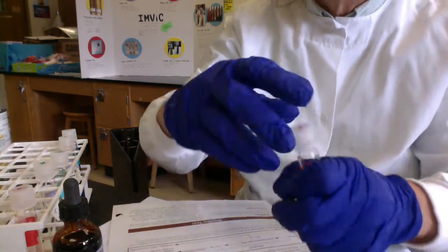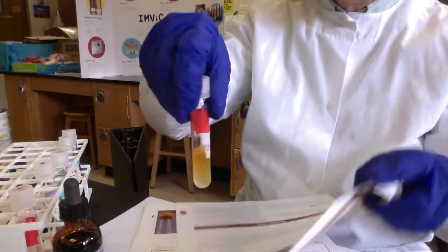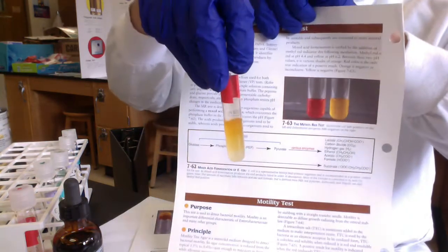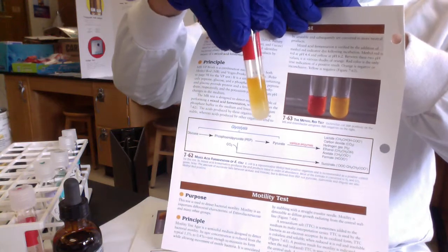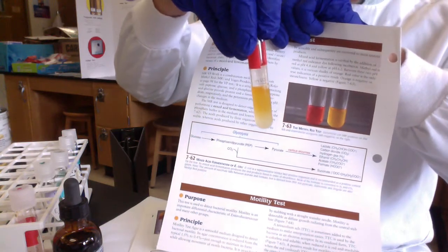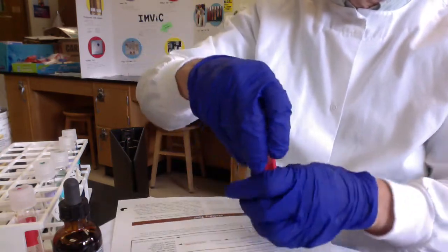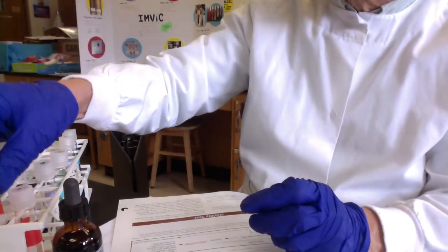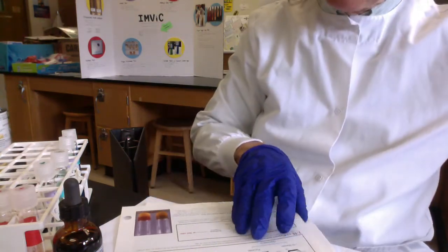Okay, so you guys, let's see what happened to our Enterobacter aerogenes and methyl red. And folks, see how it didn't turn red? Okay, so that's MR negative. That tells us Enterobacter aerogenes doesn't use mixed acid fermentation. Okay, all right, so far so good. They read the lab manual while they were incubating. Good. Okay, folks, the next test of the IMViC test is the Voges-Proskauer test.